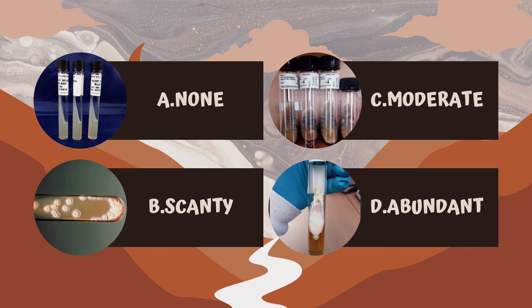A scanty or small amount of growth is usually indicated by an organism during its culture period. Moderate is usually indicated by an organism having neither too much nor too little growth. Finally, abundant. It is usually indicated by an abundant quantity.